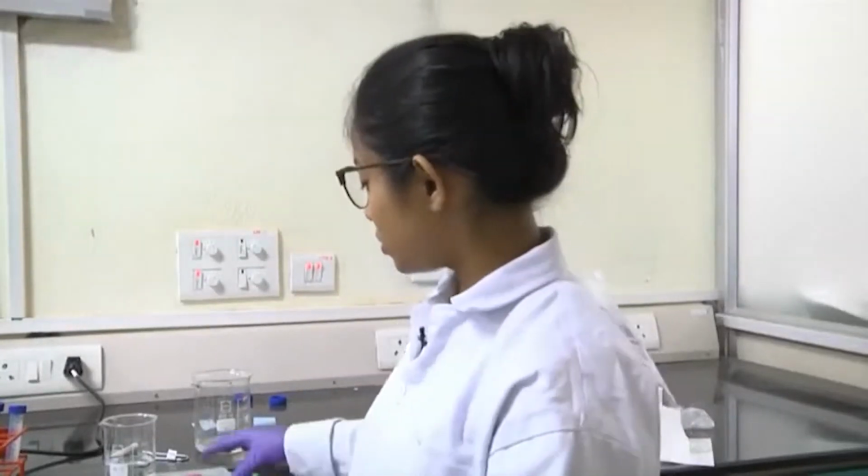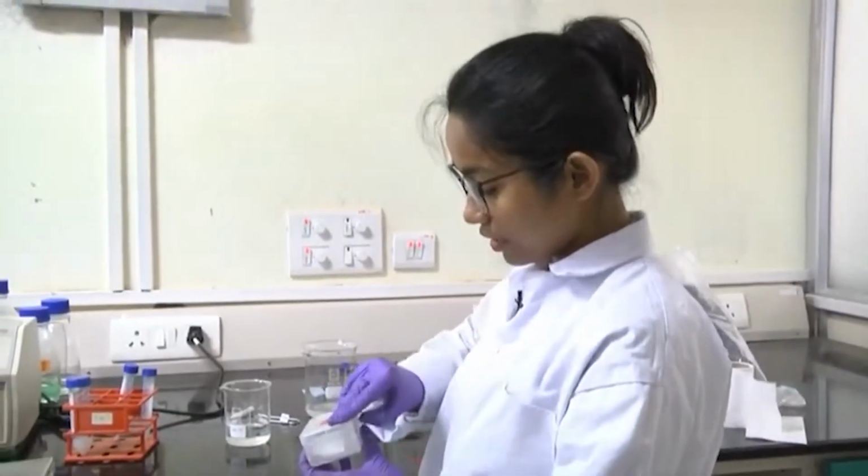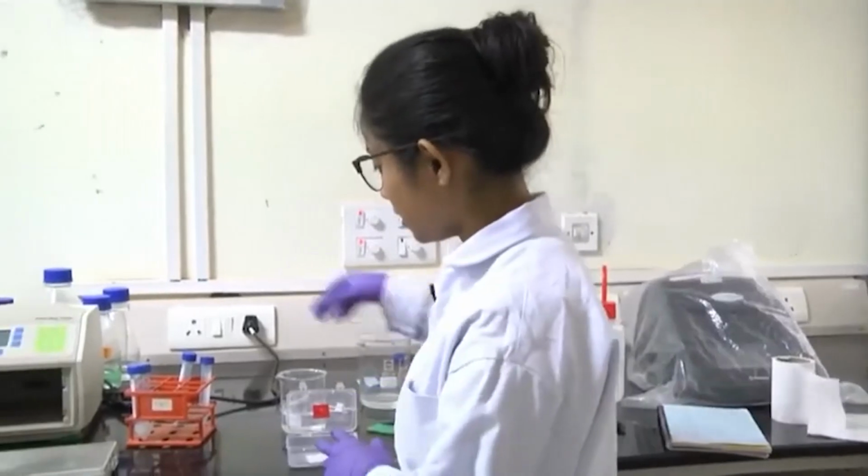So it's almost 2 hours in the primary antibody. Now I will remove the primary antibody.